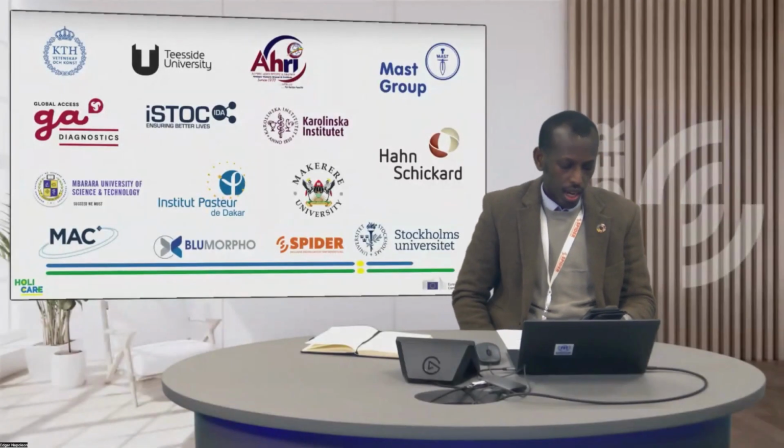Thank you. The second question is to Dr. Friedrike. The LAMP Primer Bank, is it your own collection or international collection? No, it's not our own collection. It's from the University of Marburg, a German university, and they have made this collection of published LAMP assays on respiratory tract pathogens. Yeah, and it's for research use only.